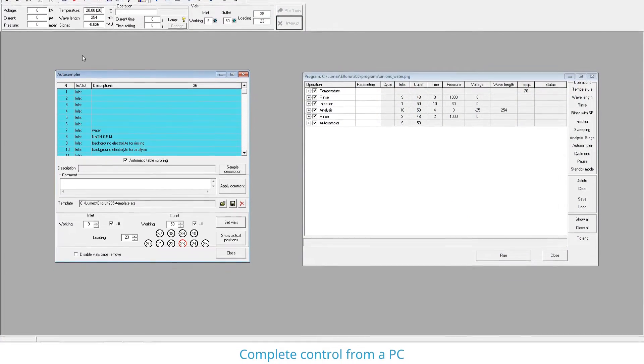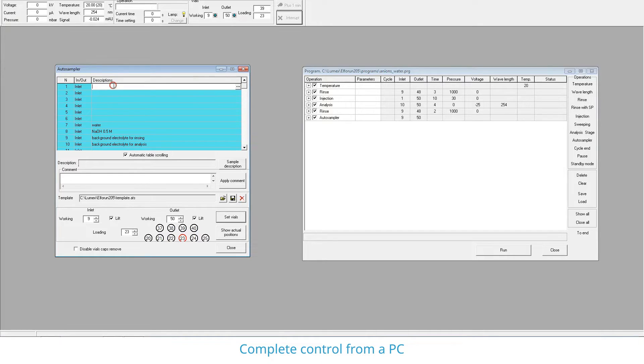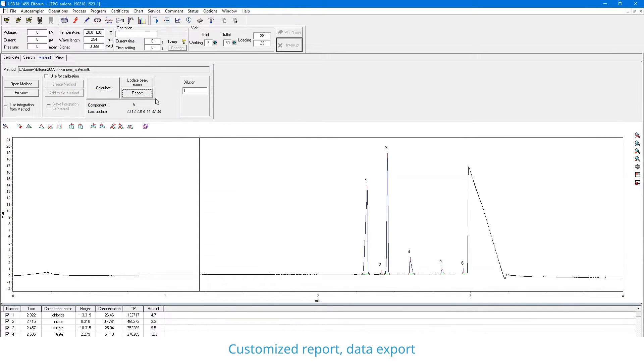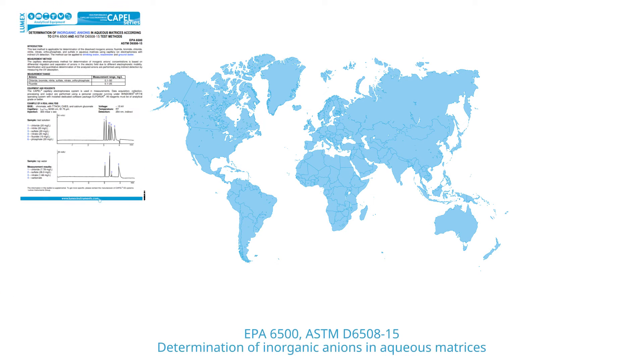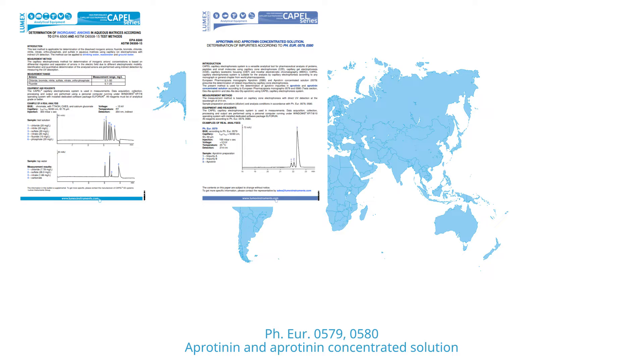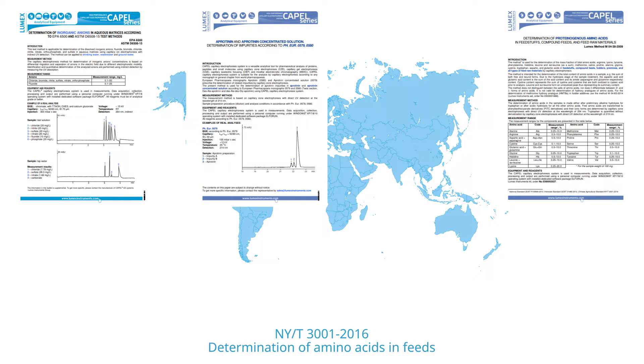CAPEL 205 is run by the powerful and user-friendly ELFO-run software that controls the instrument and acquires and processes the data. Another advantage is the wide library of validated standard operating procedures that can be run on one instrument.